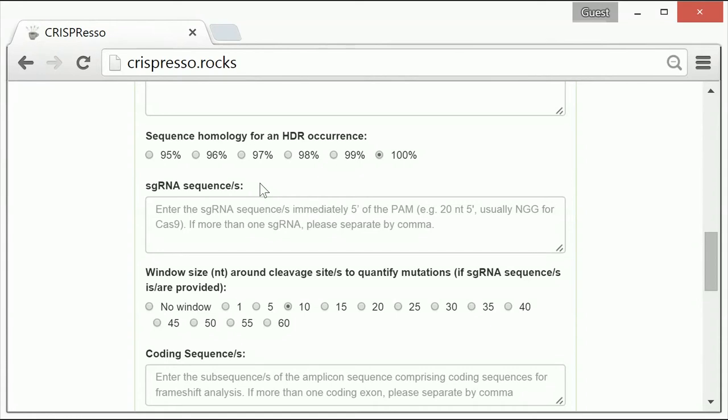If multiple guide RNAs are used in the experiment, they can all be entered in this field, separated by commas.